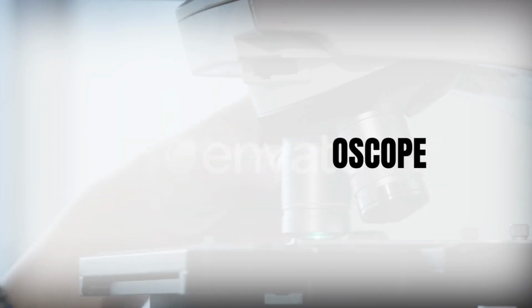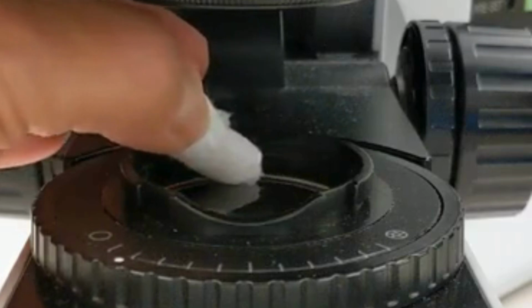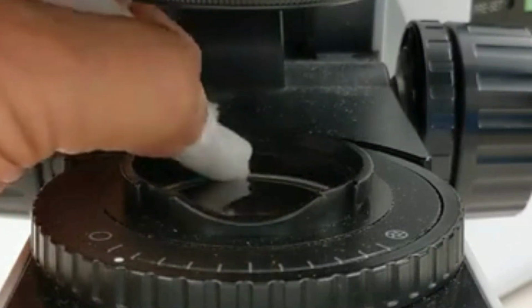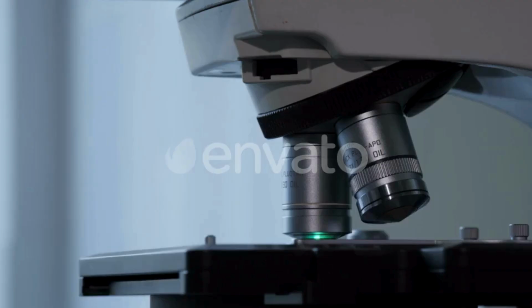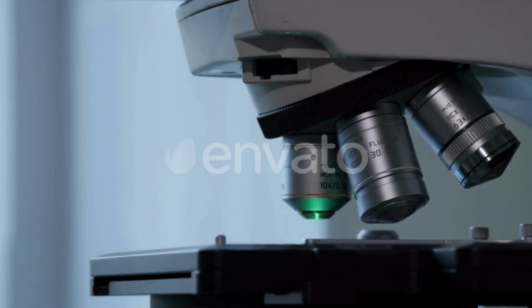Care of the microscope. 1. Before and after the use, all the lenses and metal parts including stage should be cleaned out. The lenses are cleaned with tissue paper, muslin cloth or soft and clean handkerchief. 2. Microscope should be kept covered when not in use. 3. Objective should not be ordinarily removed from the nosepiece.